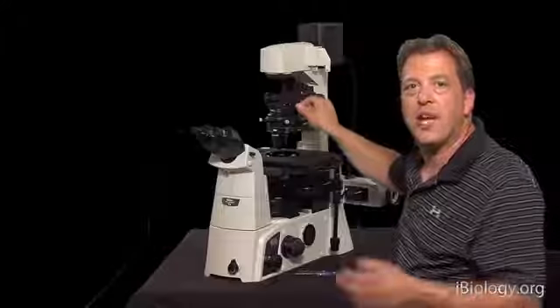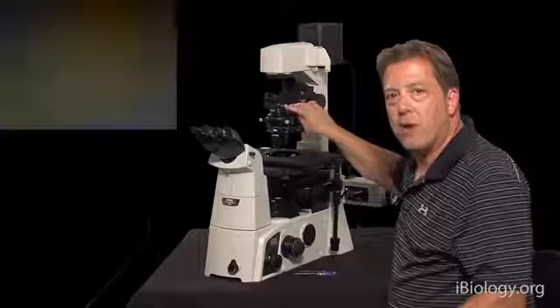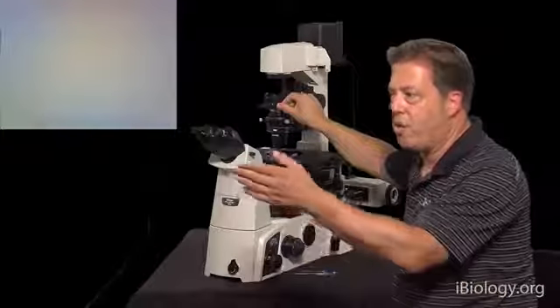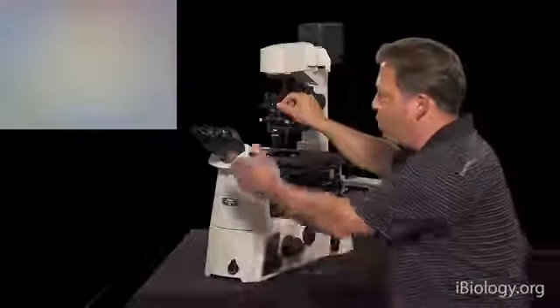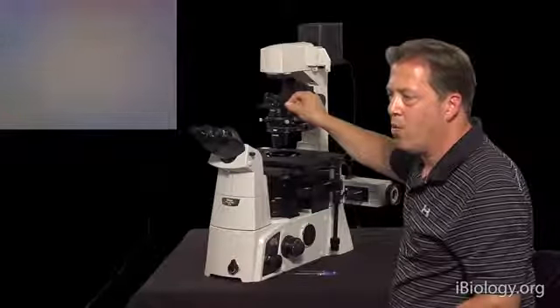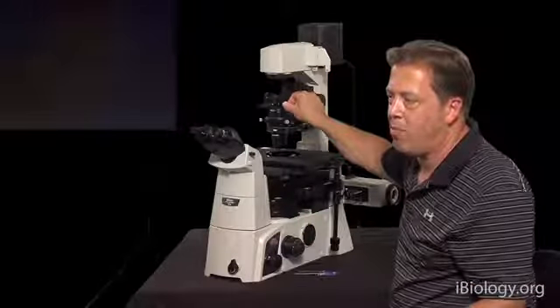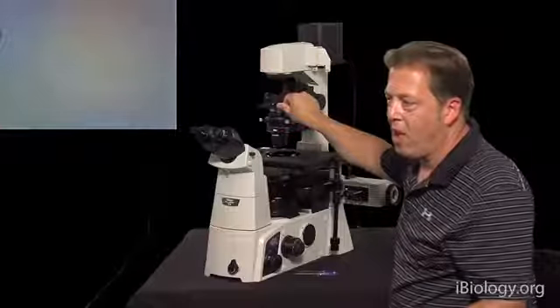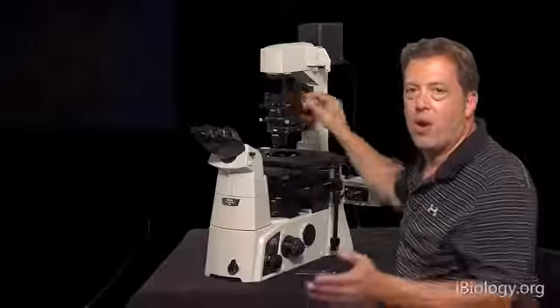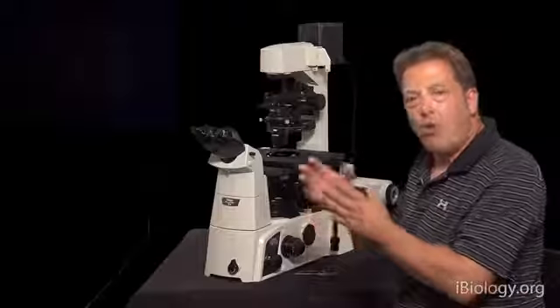And what I want to do first is look at simple polarized light. So now if we put the polarizer in the microscope with the analyzer, you can see through the eyepieces, on the camera, because we have an eyepiece camera here, that we can move closer and closer to extinction, and when we reach extinction, the light is completely attenuated and you have a black background on the camera. Okay? So you have light coming through, and then as you're moving towards extinction, you get to a point where you have completely crossed polars.